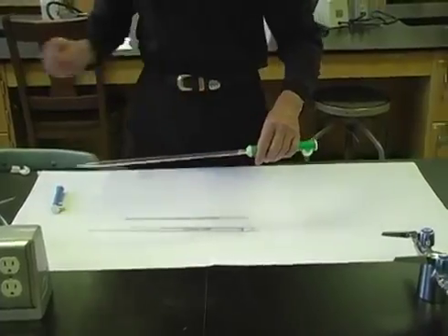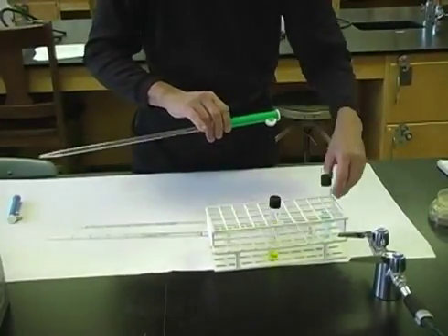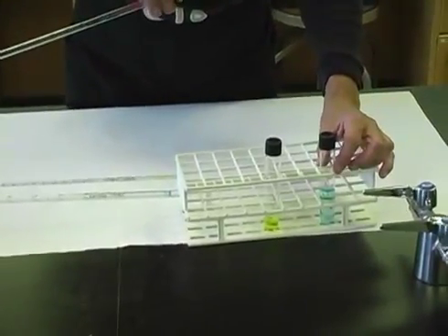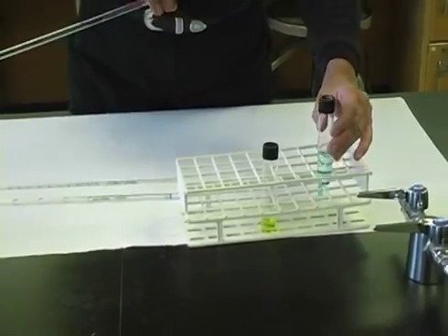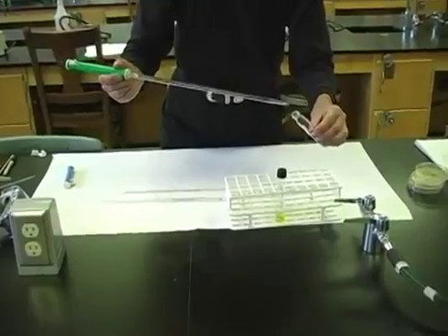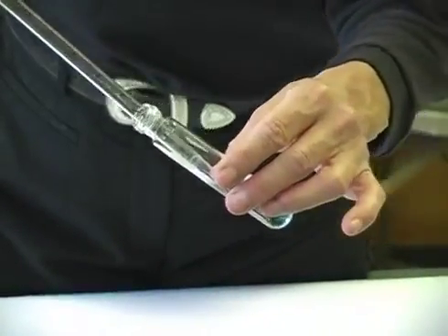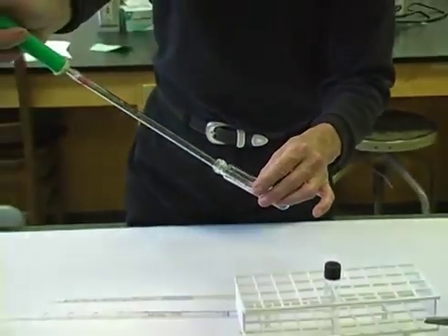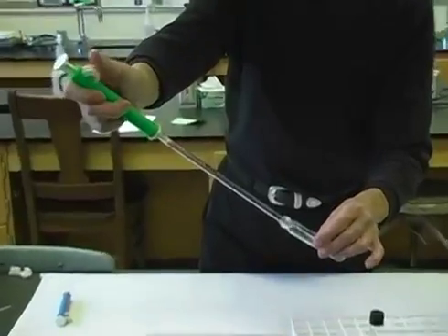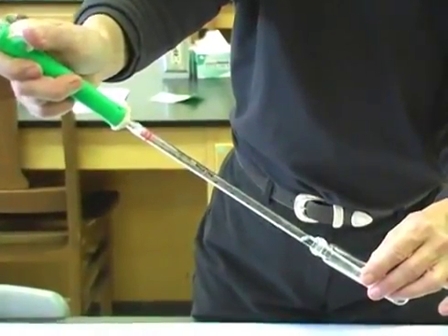If we want to transfer liquids or microbes from a broth culture to a new tube, using aseptic technique, the flaming techniques that we demonstrated earlier, we would place the tapered end of our serological pipette into the liquid we wish to transfer. We'll rotate the knob of the pipette pump, which creates the vacuum that will draw up our liquid to the desired volume.